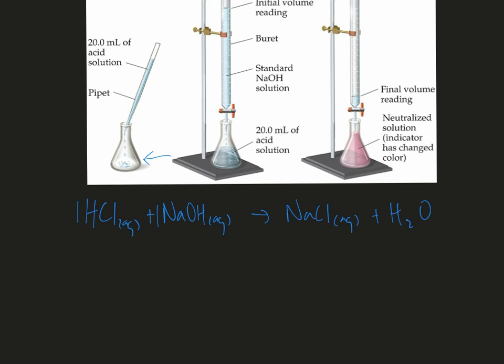In titration, we can see the equivalence point by using an acid-base indicator which changes color as close to the equivalence point as possible. Where the indicator changes color is known as the endpoint of the titration. A few drops of the indicator are added to the conical flask with the unknown, and in the case of HCl and NaOH, we use phenolphthalein as an indicator. Phenolphthalein is a colorless solution in acidic conditions and is pink in alkaline conditions.